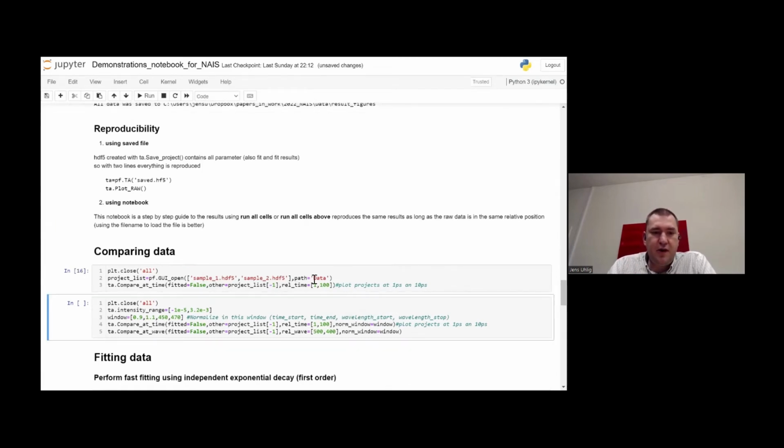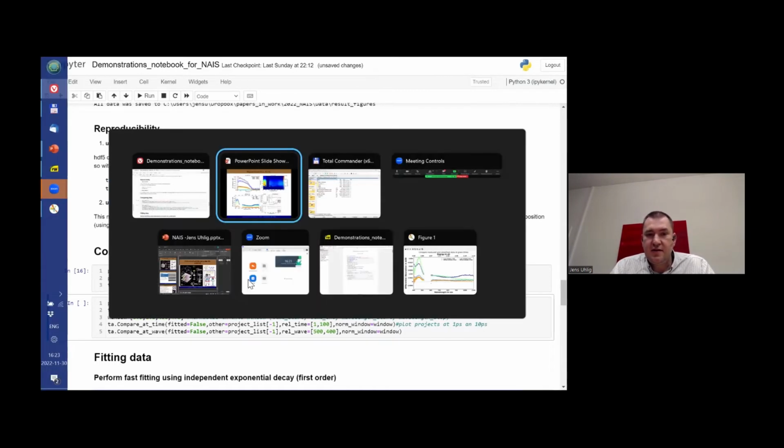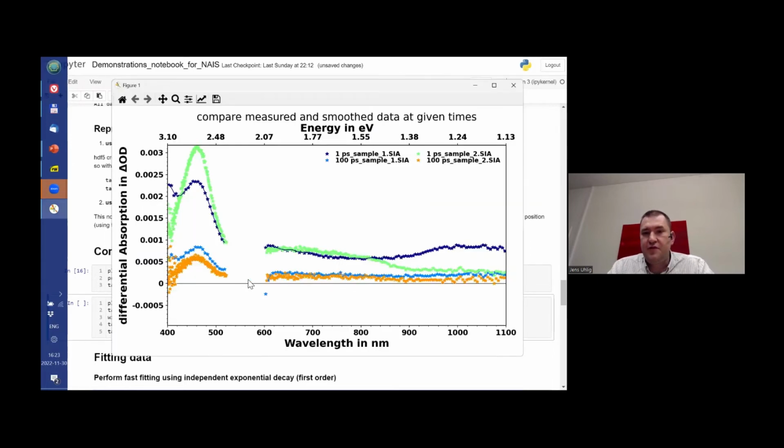This is usually the third way in which I, again, load maybe a second data set. I just need to find the plots. And I can plot the 2 different data sets with the parameters I have used up to now, and compare, for example, data set 1 versus data set 2 as different measurements. That can also be comparing different fits.